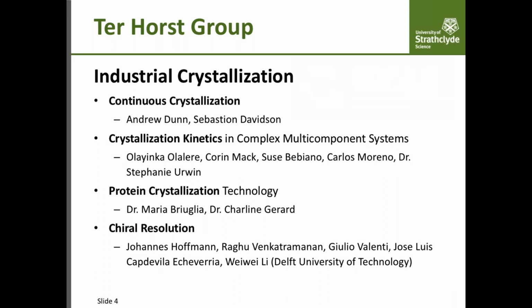My research group is investigating industrial crystallization. I made a list of the PhD students and postdocs in my group and their topics. I roughly divided them into four: continuous crystallization, crystallization kinetics, protein crystallization, and chiral resolution. So it's all about crystals and their product quality.